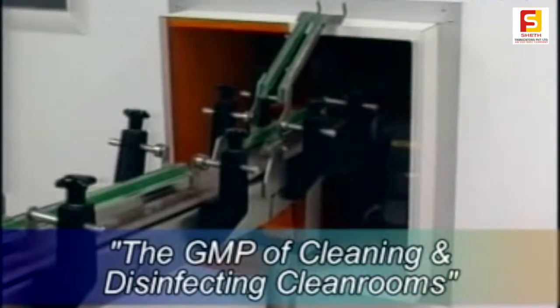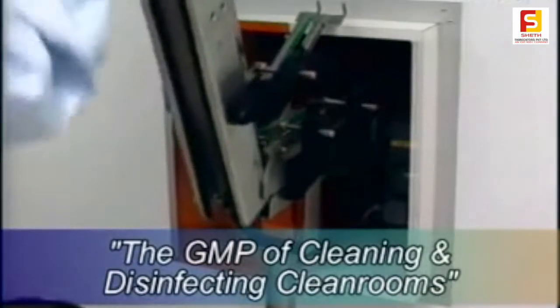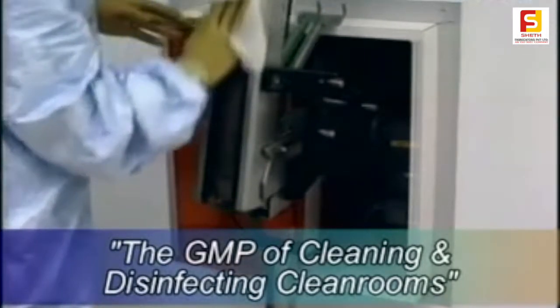Where equipment in the cleanroom has moving belts, tracks or conveyors, special care should be taken to remove any worn plastic or metal filings which rub off or abrade on the undersurfaces. This occurs frequently and the areas where it happens should be thoroughly cleaned to remove these particles.